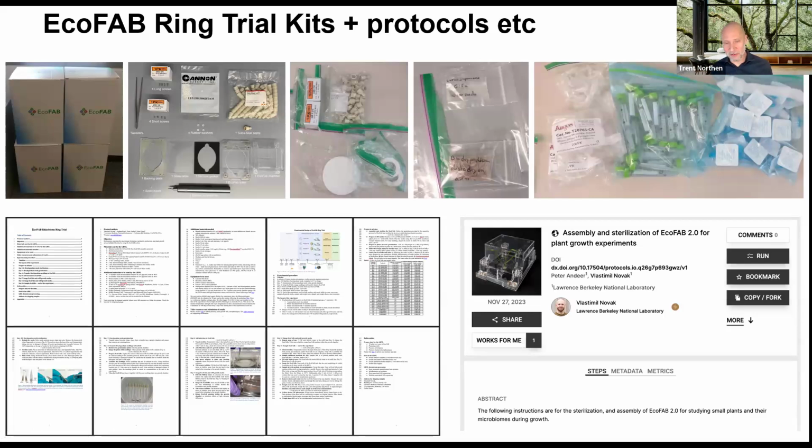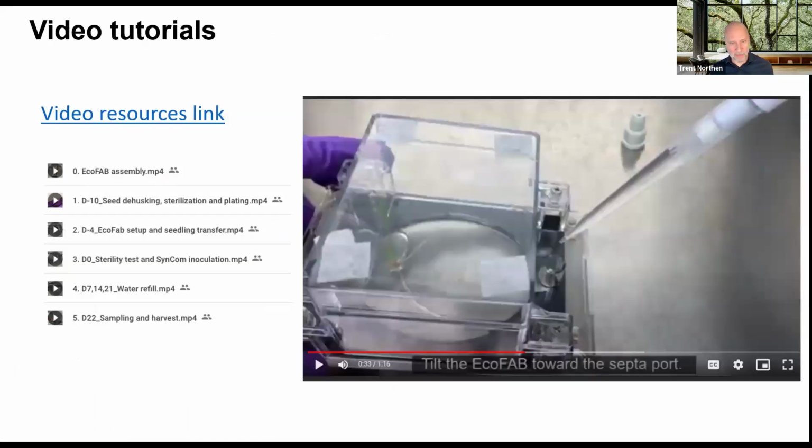And actually, we did find that even though we tried to make everything the same, the lighting in the growth chambers was different. So that's one of our big experimental variables. He also made annotated videos for all of this. Again, we want people to be able to replicate this, so you can watch the videos, follow along, and do all of the experiments.